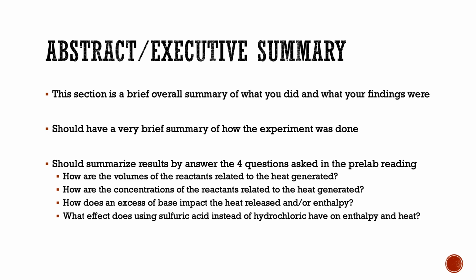all right, what did you really figure out? In particular, I've highlighted 4 questions here that CSE Pub has in the pre-lab reading that introduces these questions as things that your executive summary or your abstract should really, really focus on. And these 4 questions should all be addressed in some capacity.